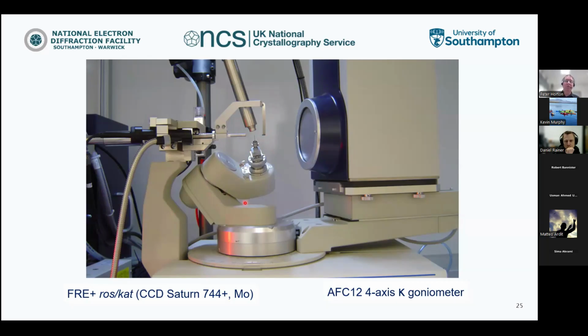The whole point of these goniometers is they can move in multiple directions. So we have phi. This rotates the crystal on the axis of the pip itself, so it just rotates around here. You then have kappa. This swings basically this way, and moves the whole arm up and down. You then have 2 theta. This actually moves the detector. So again, where you're actually detecting the diffraction from the crystal. It can move around left and right.